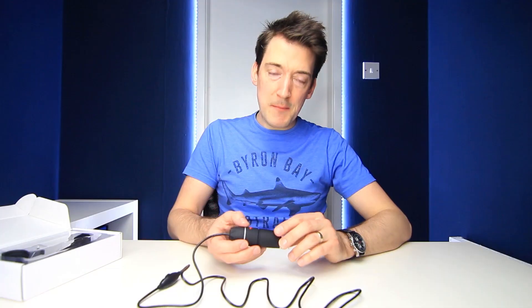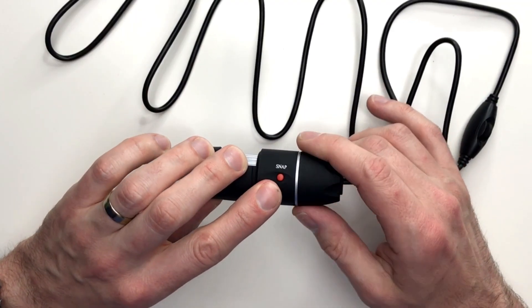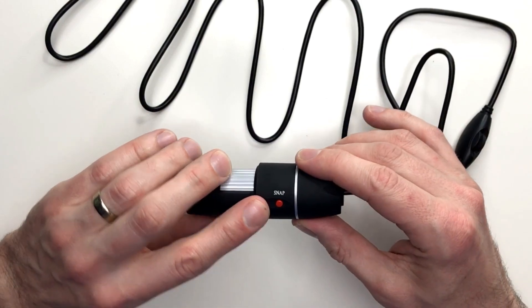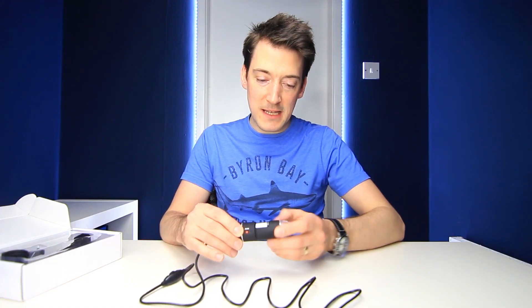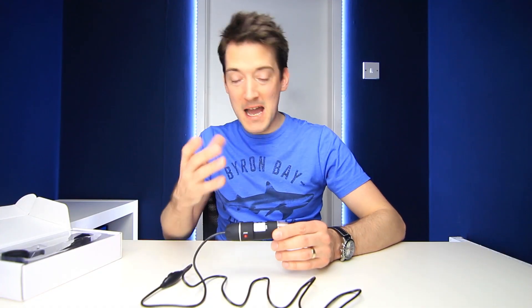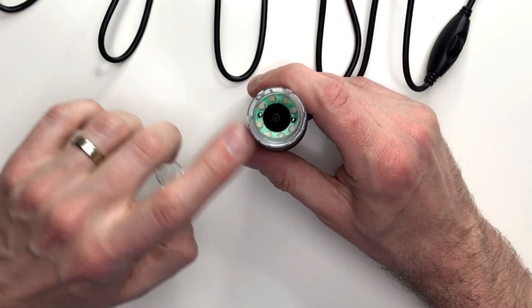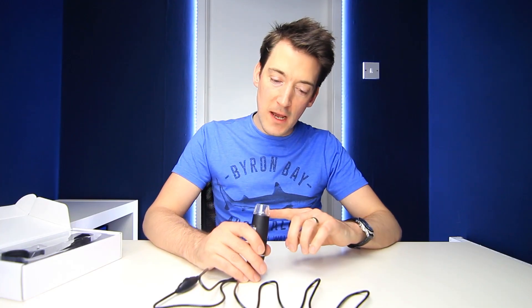You've got a little button here for zoom — I'm assuming that would be digital zoom — and then you've got another button here marked in red for snap, so snapshot I'm assuming. And then it looks like this is the wheel, a turning motion wheel, and it goes from 50 up to 500 times magnification. There are eight LEDs on the inside, so that's going to really illuminate whatever you are trying to look at.